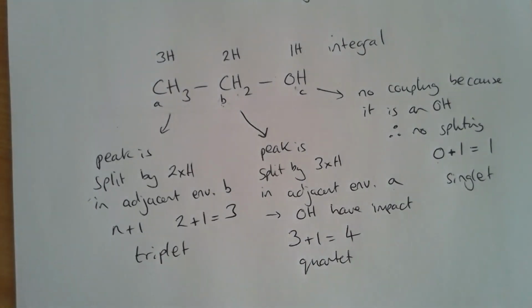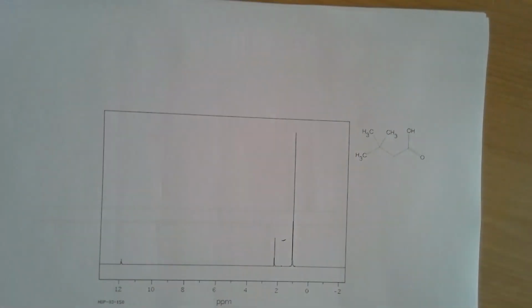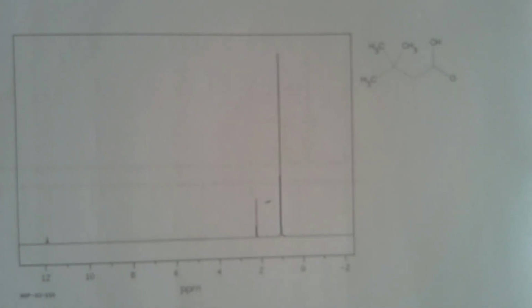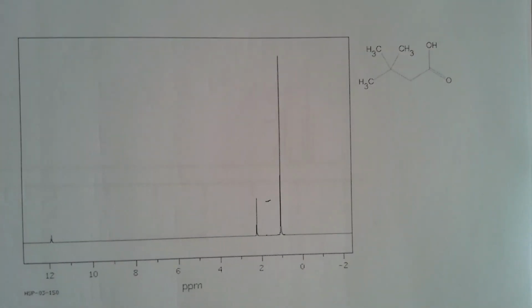We're actually going to have a look at some real spectra now. So let's have a look at this spectrum first of all. Before we actually start trying to work out what's happening in the spectrum, I think it might be worth us actually predicting what we're expecting to see first of all.